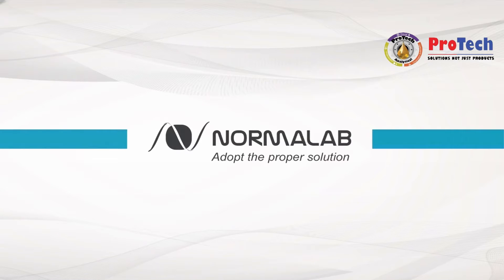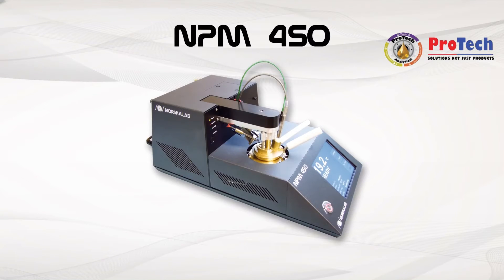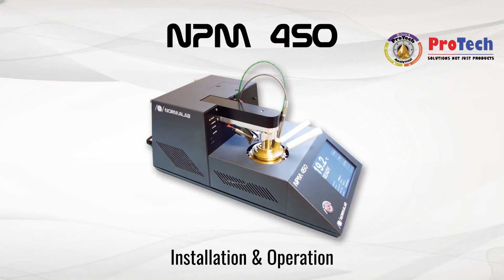NormaLab adopt the proper solution. NPM 450 installation and operation.